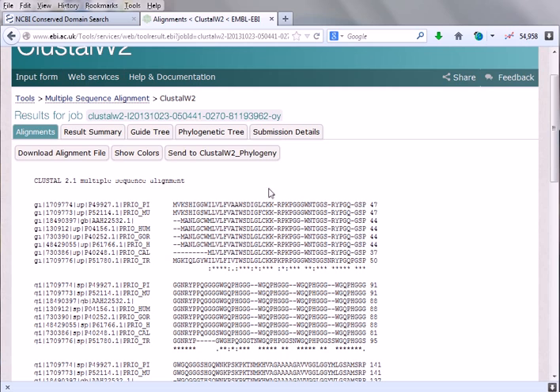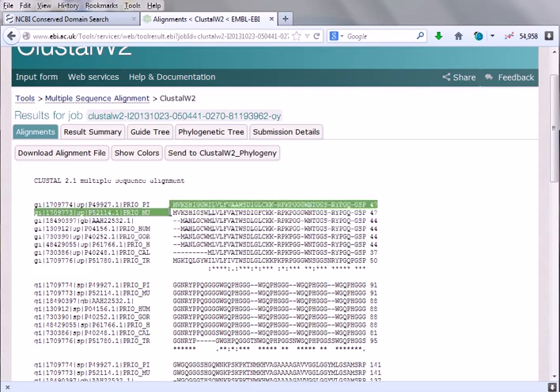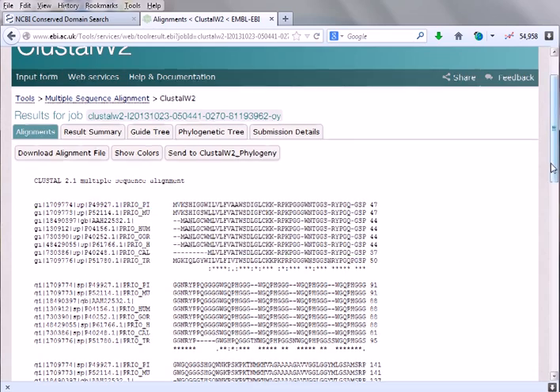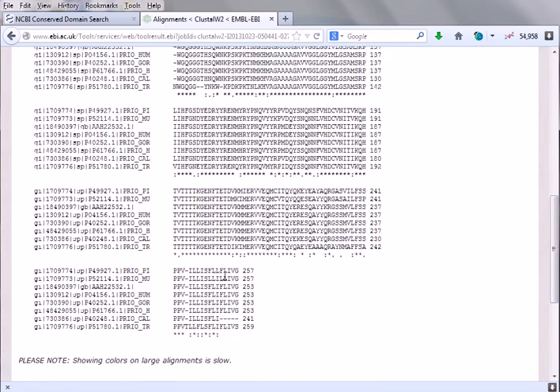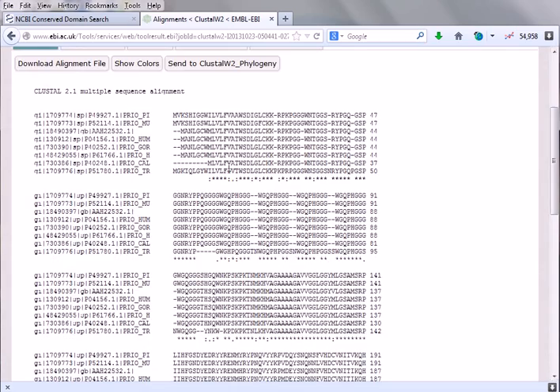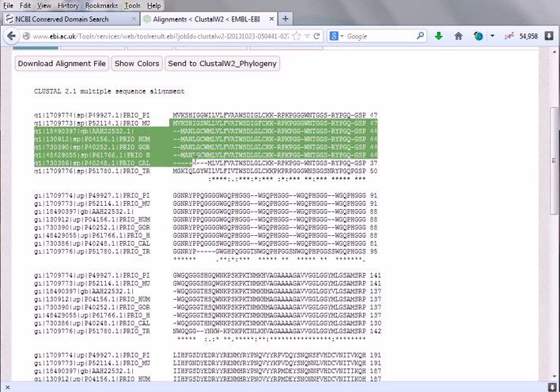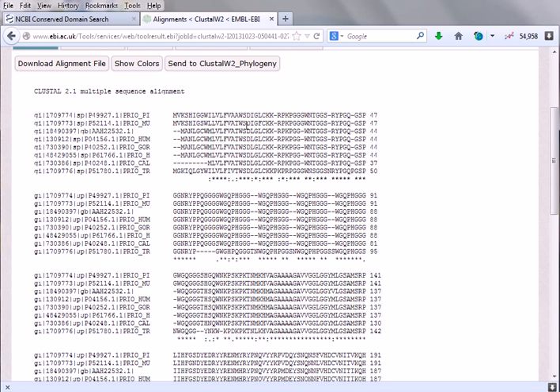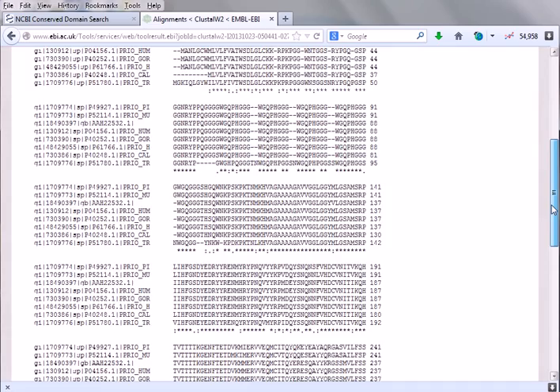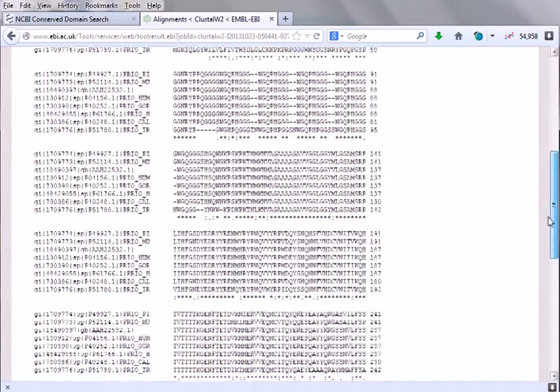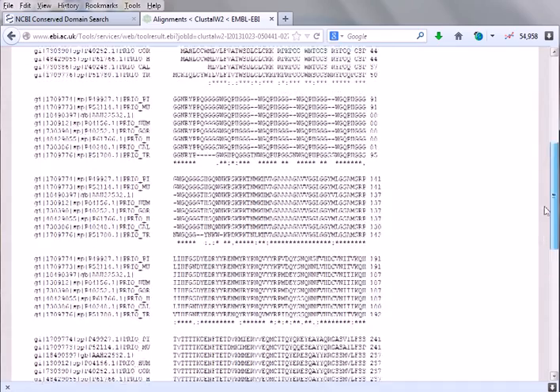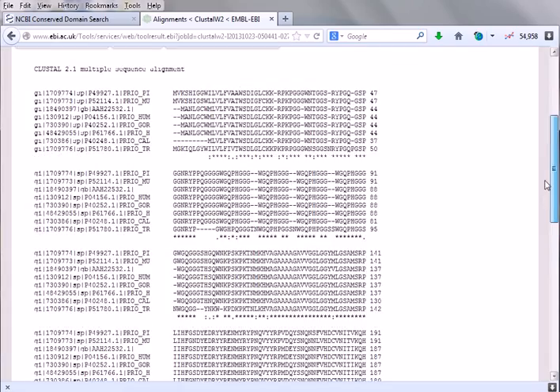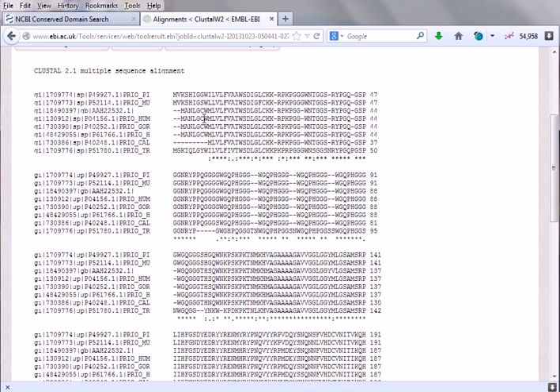What we are getting in this place is the alignment structure, and we are varying at the N-terminal. This is a very important assumption because at the C-terminal there are slight variations, but mostly you can see the variations are in N-terminal. This is the feature of the alignment by ClustalW, because it is trying to provide gaps and all the mismatches at the beginning and at the end, and try to keep matches mostly at the middle regions. So the variations we are getting, most of the variations are at this N-terminal segment.